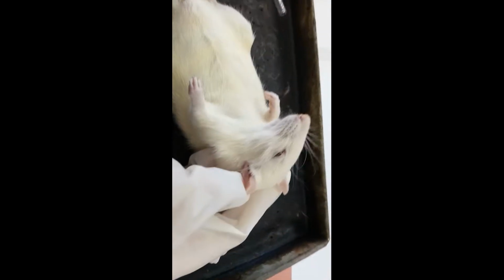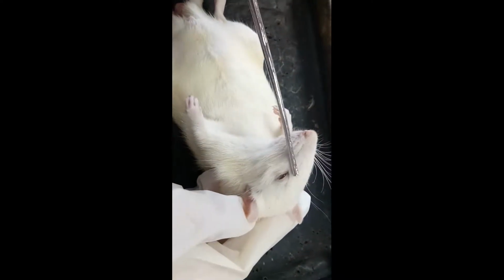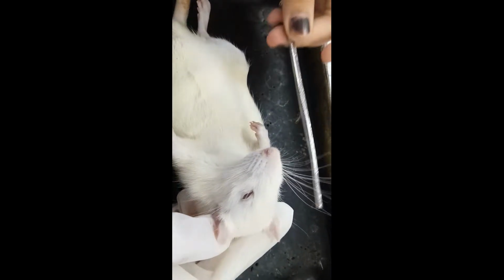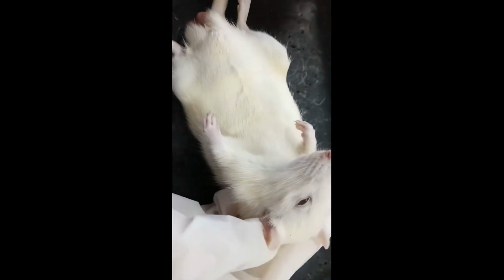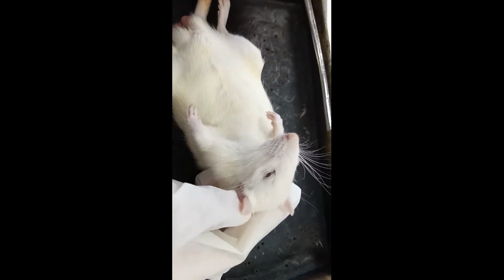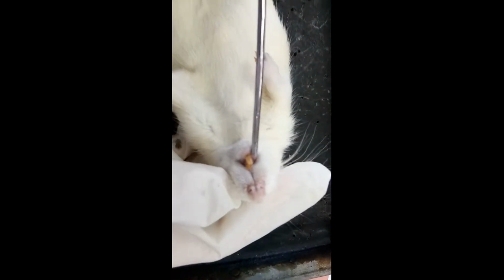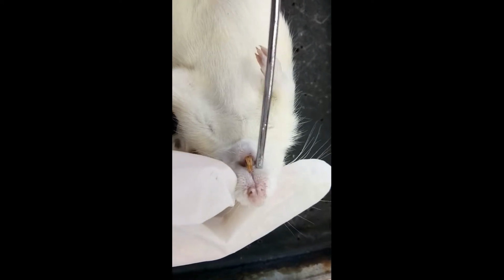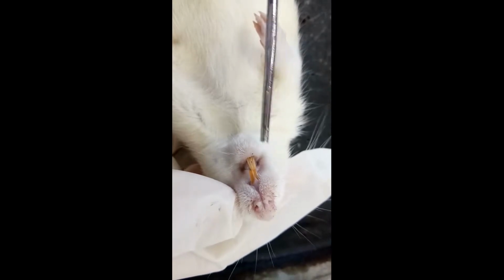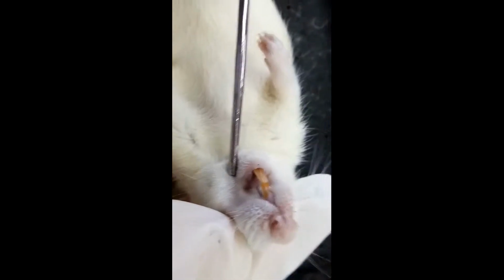And then we can also observe the vibrissae, which are long and stiff hairs present around the mouth and eyes that function as tactile sense organs. Next is the mouth. We can see that the mouth has a cleft upper lip. The upper and lower incisor teeth are present, but the canines and premolars are absent.